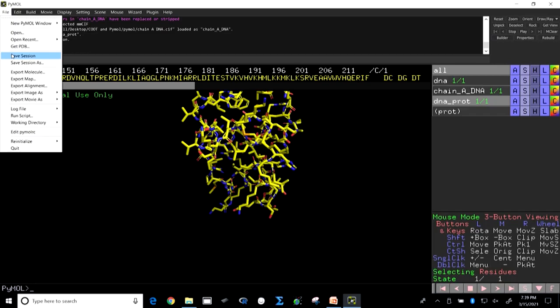When I saved, if you remember the PDB, the part of the DNA, it was saved as a .pdb file. It generates the coordinates again as a part of the double strand DNA.